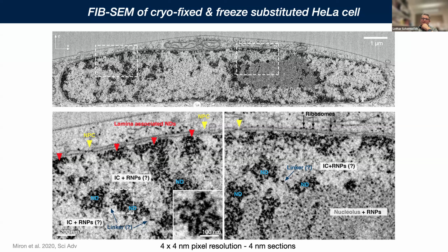So we have these assemblies of dark dots, and this is the nuclear envelope. Here are sites of nuclear pore complexes. And then these areas of more indifferent light gray areas with single individual isolated black dots.